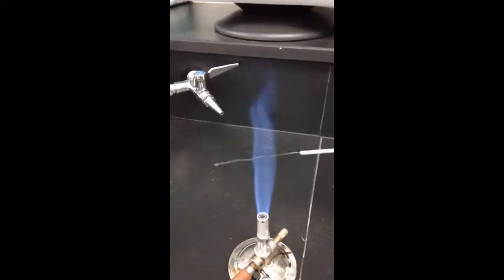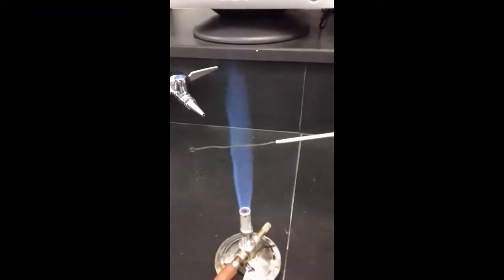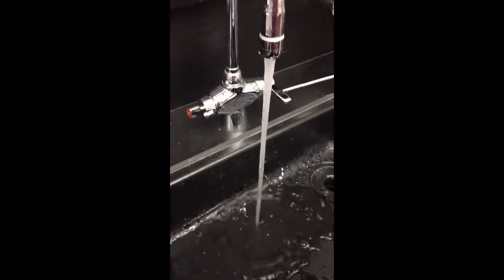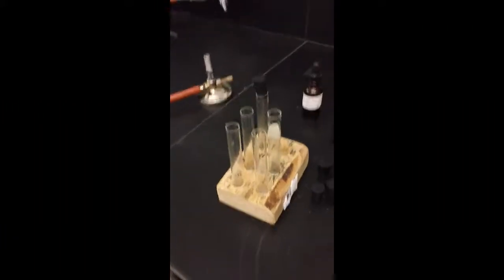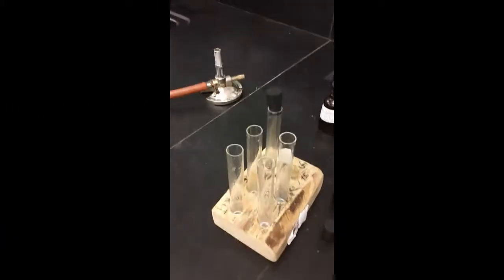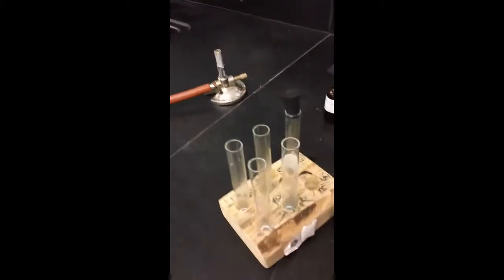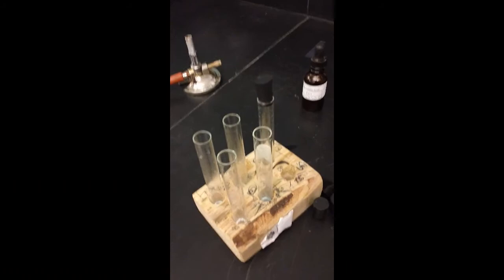So here. Now what I'm going to do is make sure I have a nice clean test rod, and then I'm going to go dump my chemicals in hazardous waste and wash out my tubes before I do test B. So I'm going to shut off the camera real quick while I do that. I'm going to go clean my test tubes. I'm going to make sure I turn my Bunsen burner off. Okay, so I'll walk over to chemical waste, put these in there, wash out my test tubes, and then I'm going to go grab 5 more. So the same chemicals, I'm going to grab a new round of them so that I can do test B. So I'll meet you back in a few moments.